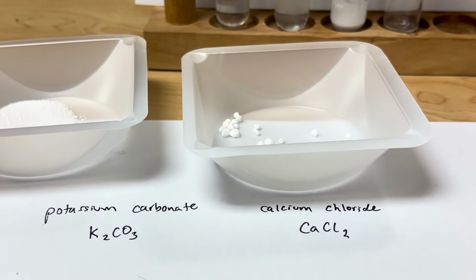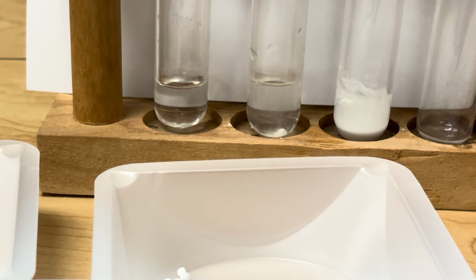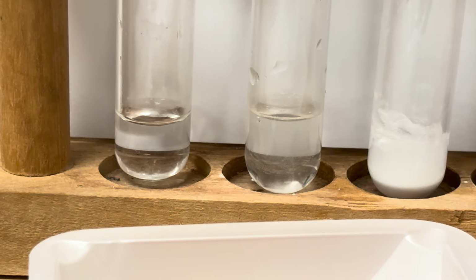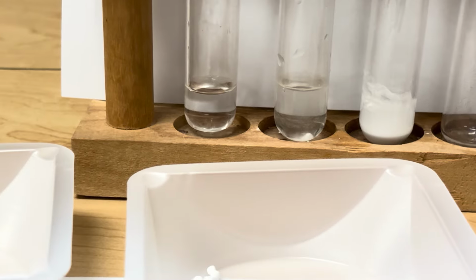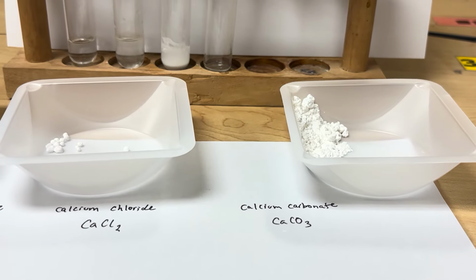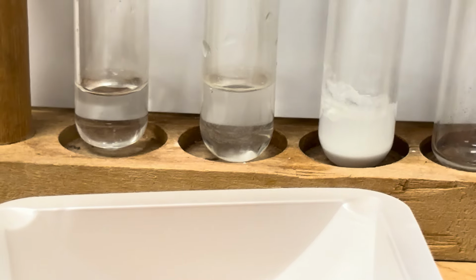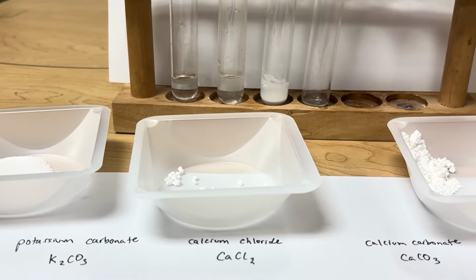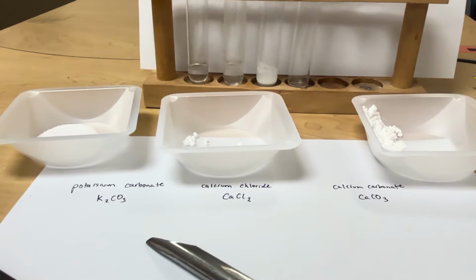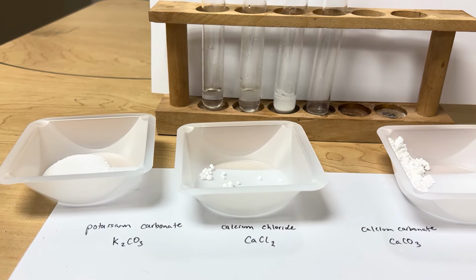My calcium and my chloride ions seem to be a little bit better at holding on to each other because they're resistant to dissolving. And my calcium and carbonate ions seem especially strongly attracted to each other.